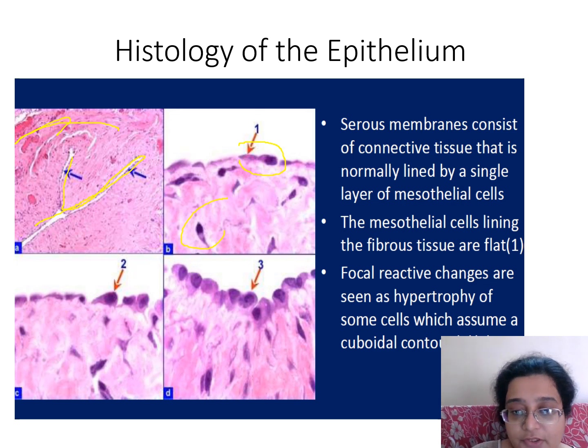and it has this kind of a flattened lining, and these are stromal cells. Sometimes due to inflammation, such plump cells can be seen, but this is not malignancy, this is reactive atypia. Something like this which was flat has become like this. Okay, so this is atypia. Even this kind of a hobnailing is atypia. Okay, this is focal or diffuse reactive hypertrophy.